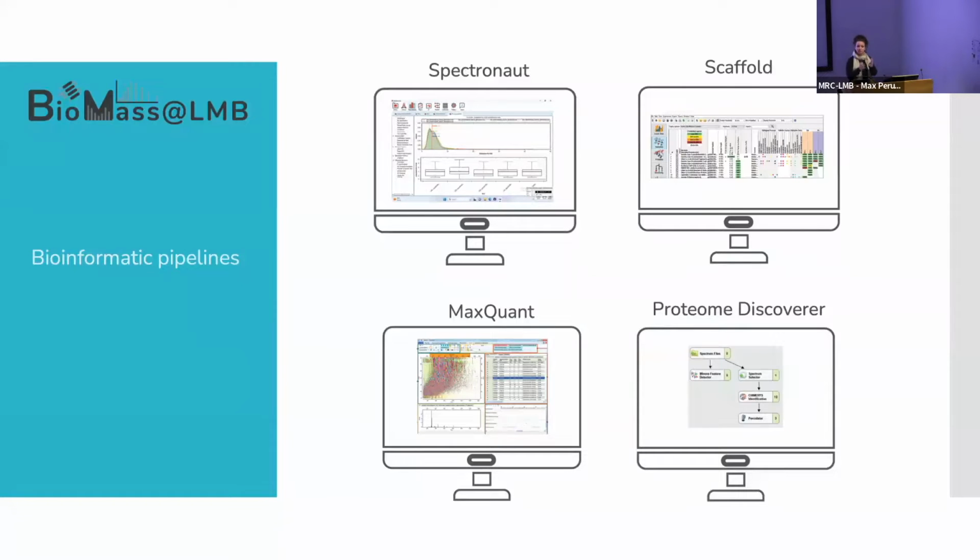For instance, if we are looking into DIA, the best software are DIA-NN or Spectronaut. And if we are looking into TMT analysis, Proteome Discoverer is probably one of the best ones, as well as MaxQuant. So if I sent MaxQuant and then DIA-NN and did not offer support for you to look at your data, it would probably get really complicated for you. So the reason why I'm doing this in PD is because we don't have a bioinformatician in-house. Again, this is about to change.